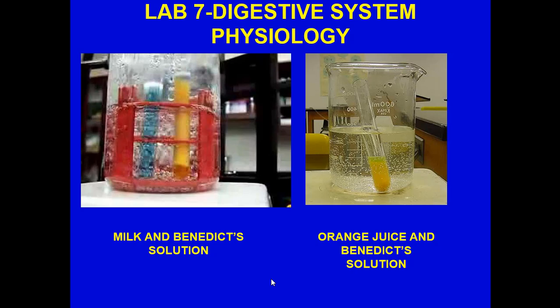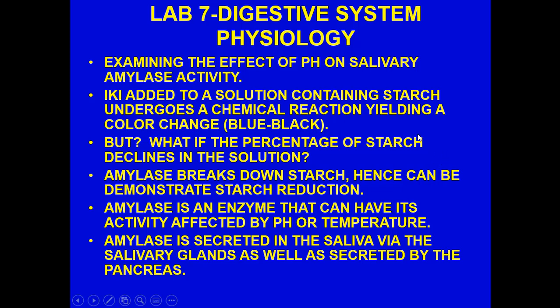You do get a slight positive reaction. If you notice on one side of the test tube here is the blue Benedict's, but in the next one they have Benedict's added with milk. Same here. So you get some reaction, okay?